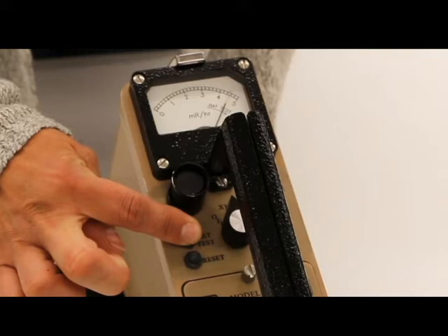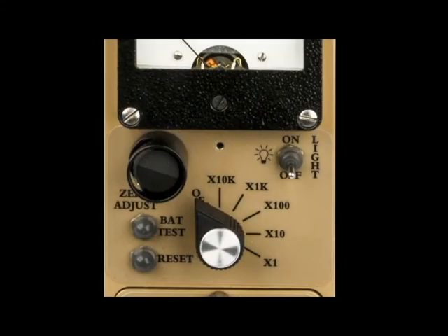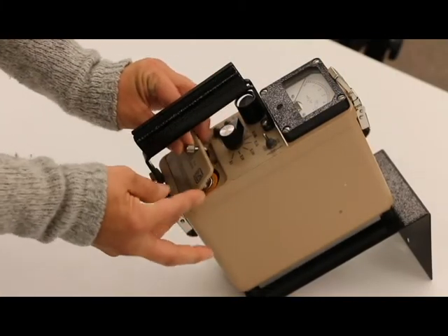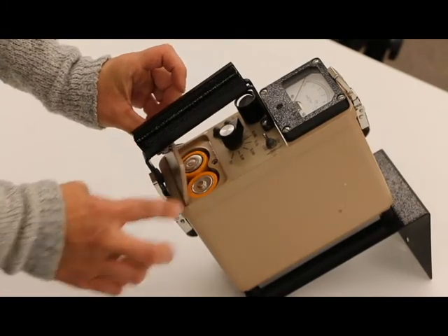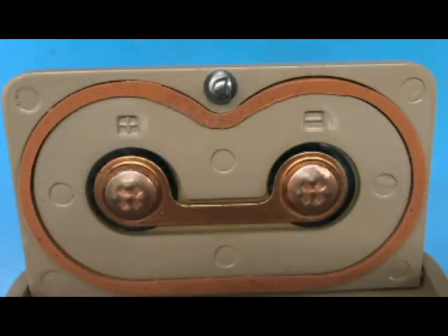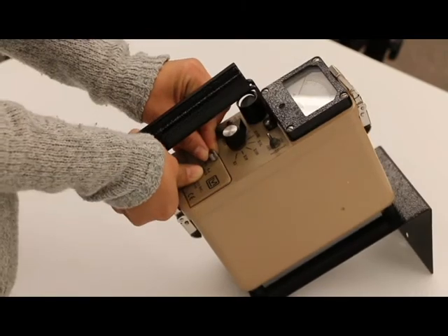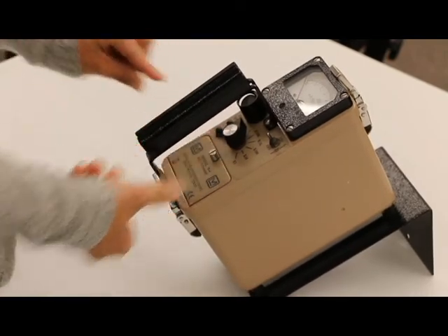If the meter does not respond, check to see if the batteries have been correctly installed. To install batteries, ensure the range selector switch is in the off position. Open the battery lid by pushing down and turning the quarter-turn thumbscrew counterclockwise a quarter of a turn. Note the plus and minus marks inside the battery holder and match the battery polarity to these marks. Close the battery box lid, then push down and turn the quarter-turn thumbscrew clockwise a quarter of a turn.